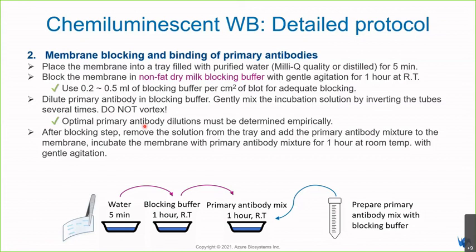Right. Next, after the blocking step, we remove the solution from the tray, or you can just transfer the membrane to a tray filled with this pre-prepared primary antibody mix. Pour it on the membrane and incubate it for 1 hour at room temperature with gentle agitation.